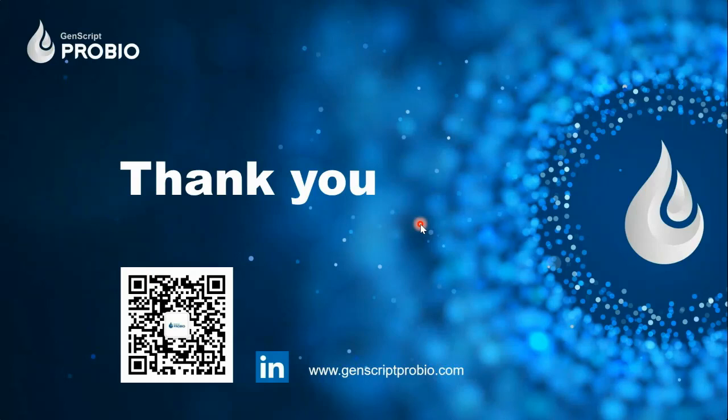Again, it needs to be optimized. It needs to be checked where and how it can be helped, and especially the nuclease treatment will help you to optimize as well. In some of the projects we have done it after the harvest. In some of the projects you do it in the middle of the process. So you just have to optimize and see. It's still a very challenging problem when it comes to the impurities, which are HCP and HCD.